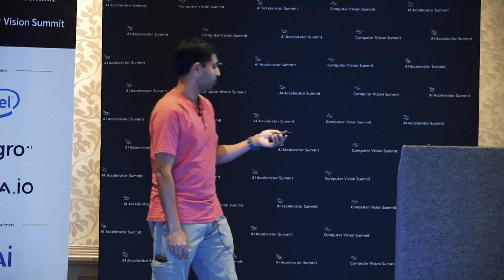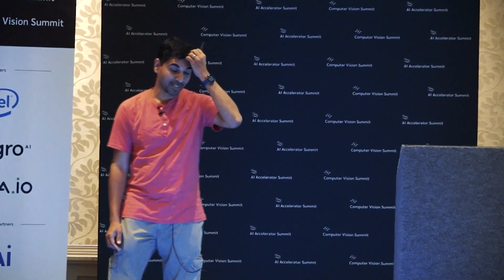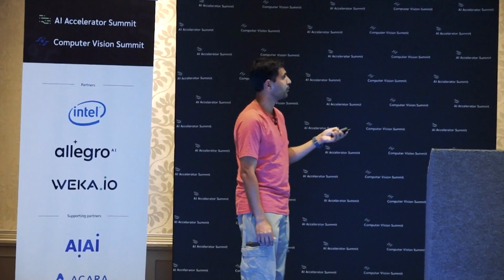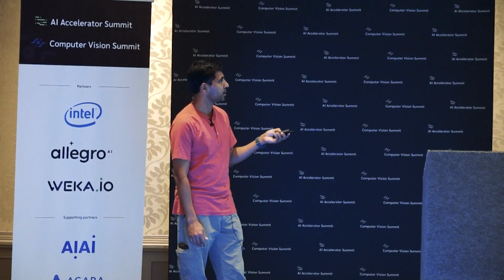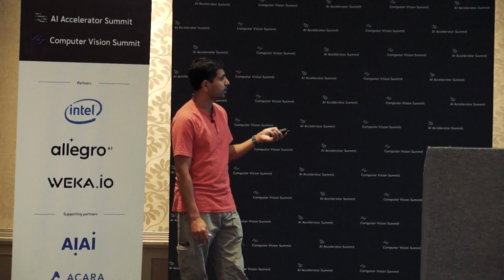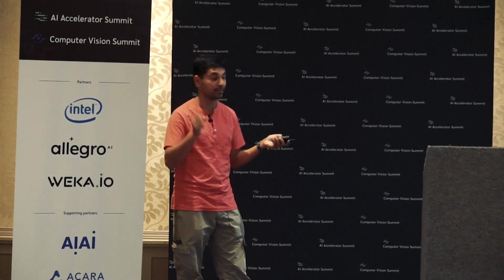So I think that brings me to the end of my talk, sorry, there's one last plug for what Calico does. So here again, this is what we call a lifespan machine, a yeast lifespan machine. These little structures here are traps. So these are different wells in an assay. So these are traps, and here in the middle you see a cell. So that's a yeast cell.